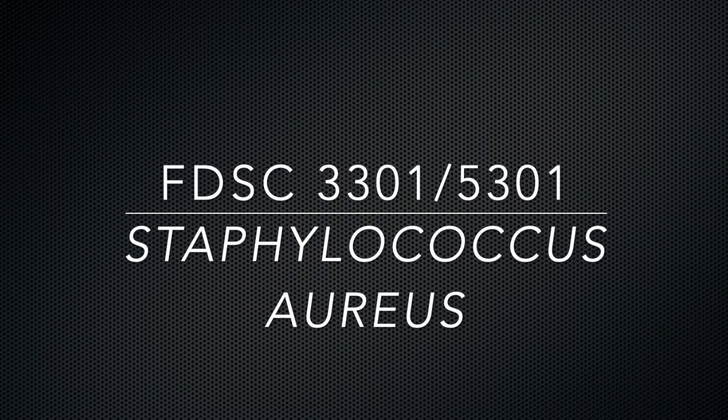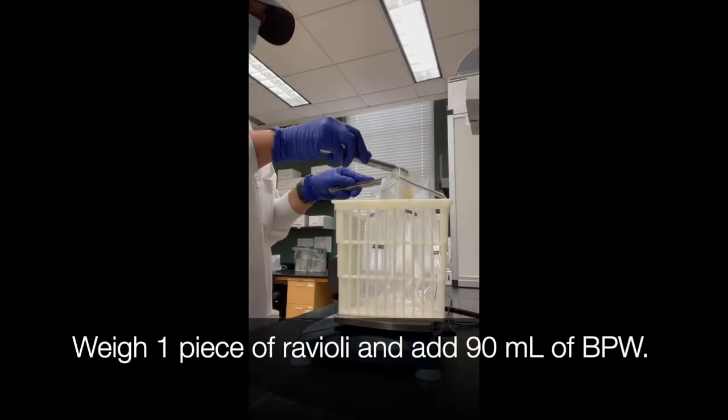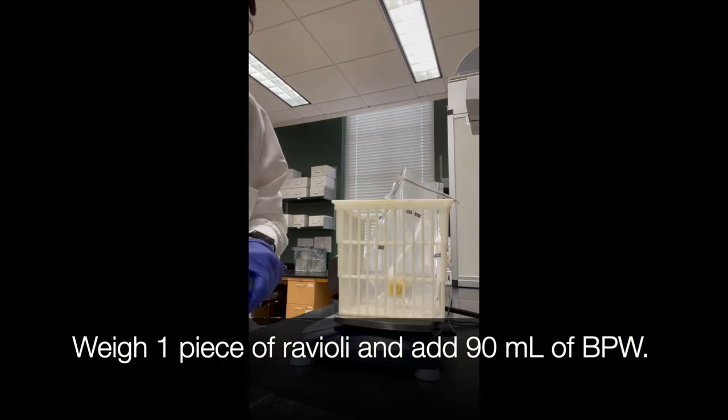For today's lab we're going to be looking at Staphylococcus aureus. Step 1 is to make your 1-10 dilution. Weigh one piece of ravioli and add 90 ml of buffered peptone water.